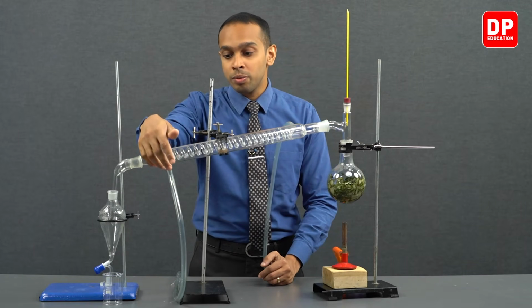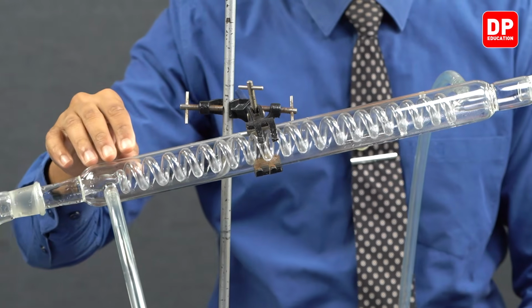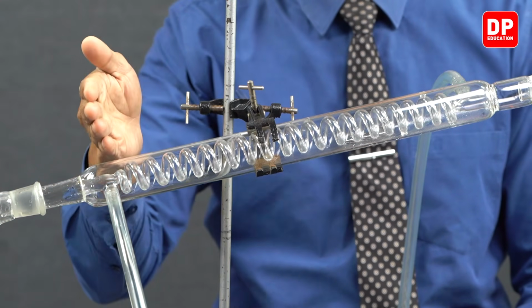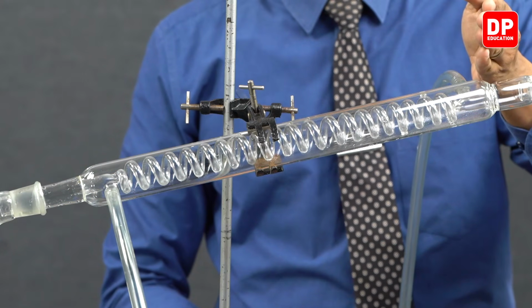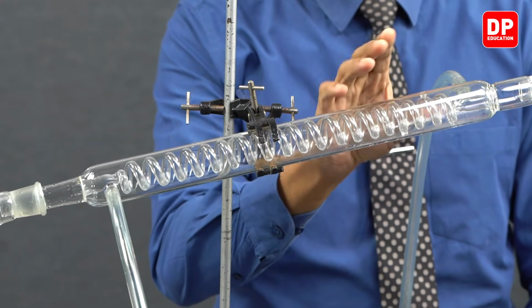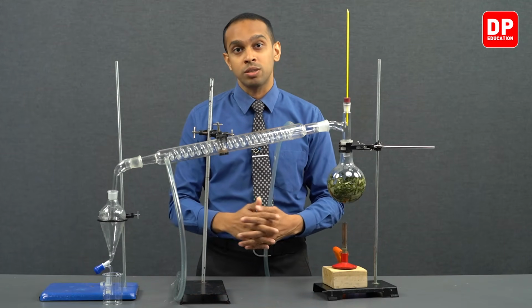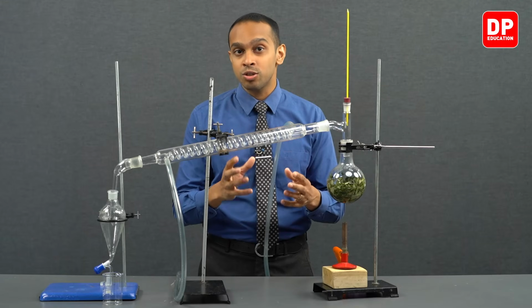Water actually will be coming in from the bottom of the condenser and will be moving up. So the water jacket will be having a water flow from this end all the way up to this end. In this way, the hottest parts of the vapor mixture come into contact with the coldest water. So this maximizes the heat transfer.